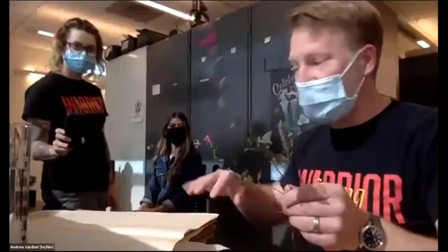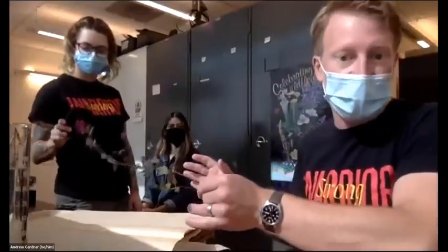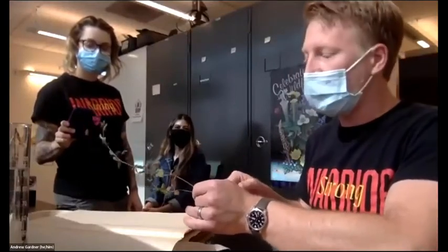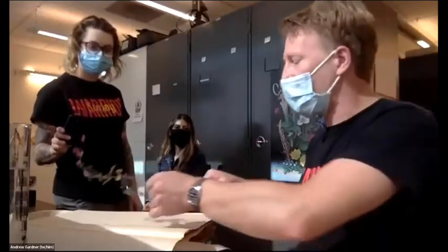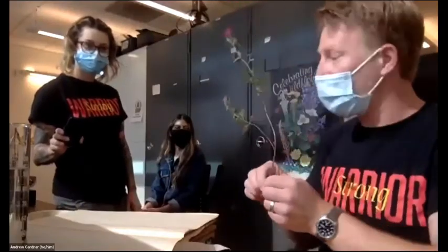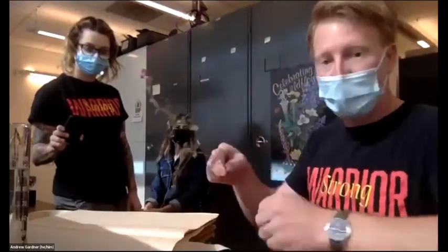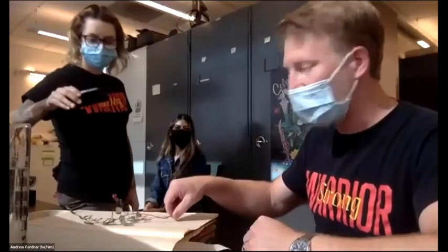On a plant specimen, we have a specific size that the specimens are. That way they all are the same size and they fit nicely in the folders. You might make smaller specimens, and that's always okay. In this case, my plant is a little bit bigger than the specimen, so I'm just going to break off a little bit. Problem solved. Then what I want to do is just set it down on my paper.